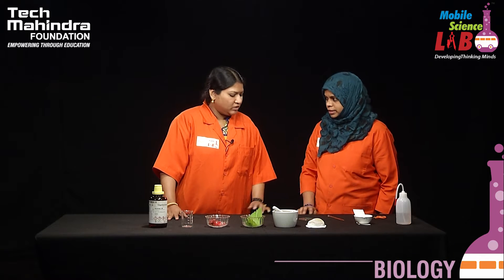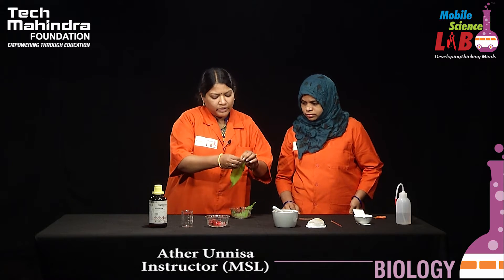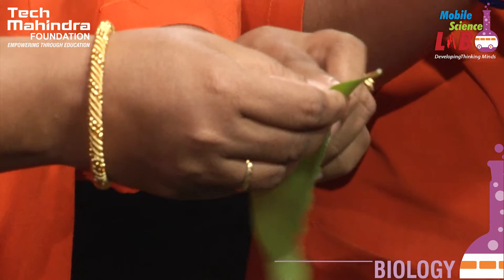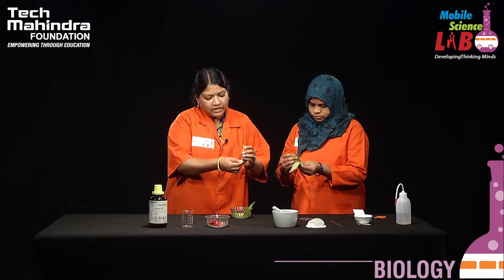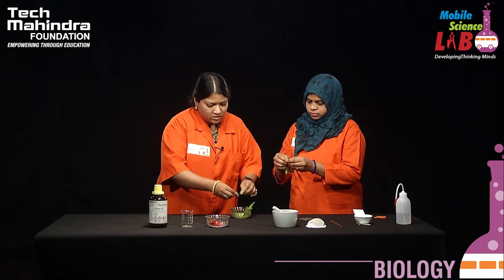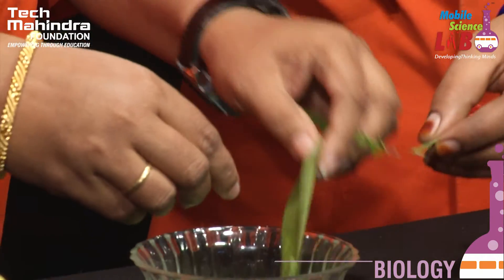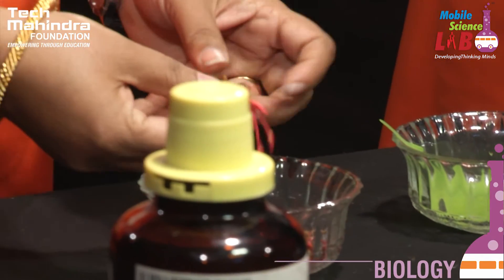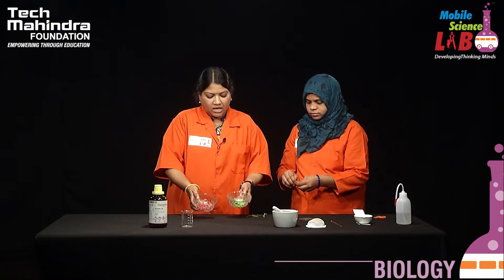Shall we start the experiment? First we have to take leaves and remove the midrib, as it will be easier to smash the leaves if we remove it like this. Similarly, we have to take the flowers and separate the petals. Now our source of pigments is ready.